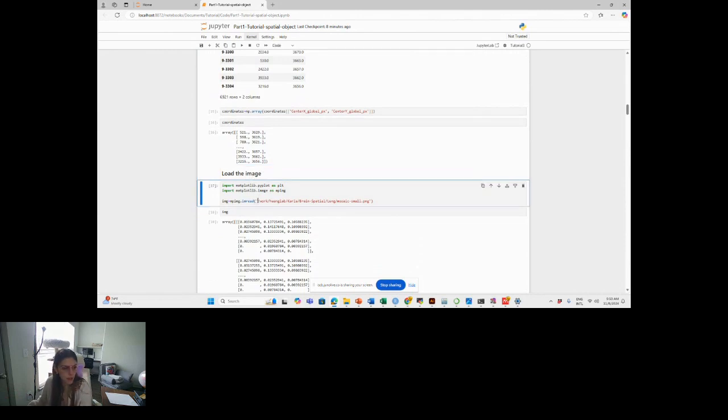The next step, when you look at the coordinates, even though the name is global, in this case, as we said, we have just a small region. So those are the coordinates of the region, right? Yes, of the region that we got.